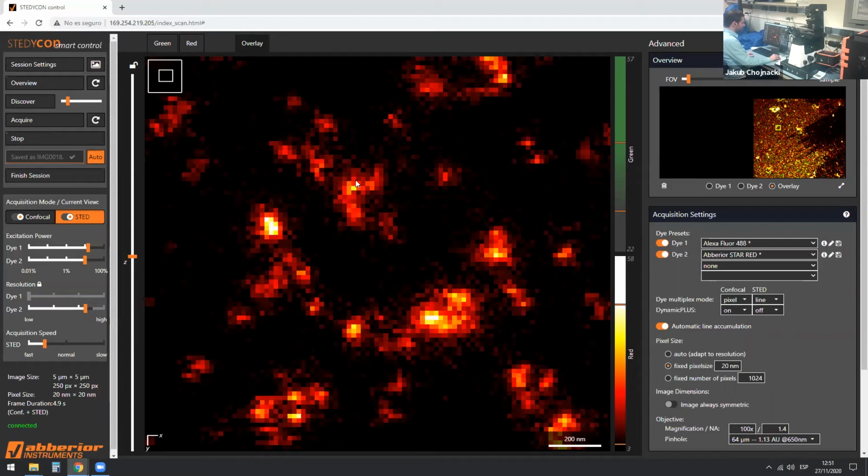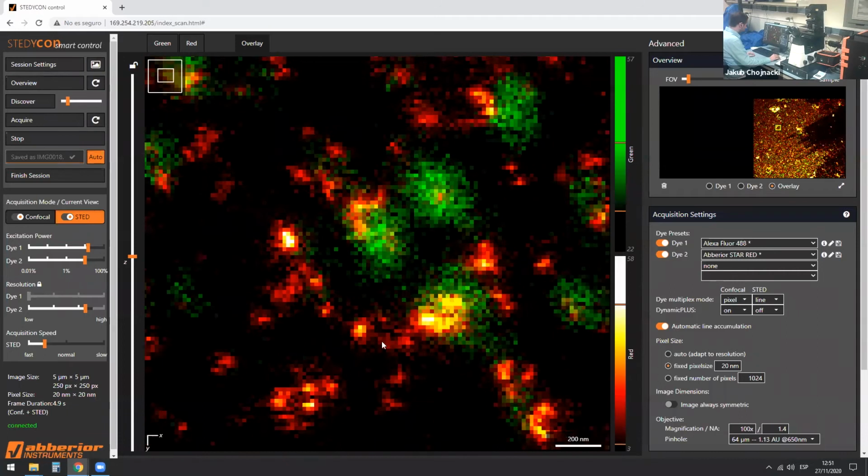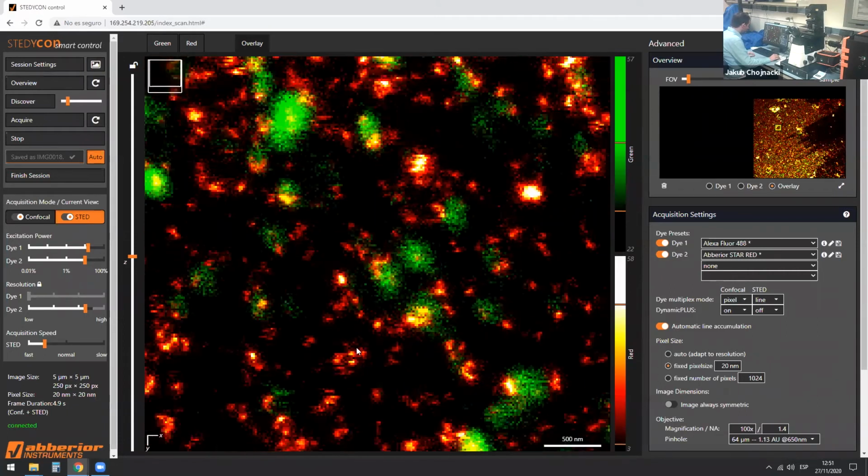So this indicates that this virus particle, for example, has surface envelope proteins a bit different than the other one. This one seems to have them a little bit more spread out. There is, I think, one here and a small semicircle of them here. I think we can see it. Maybe I saw it in another one as well.